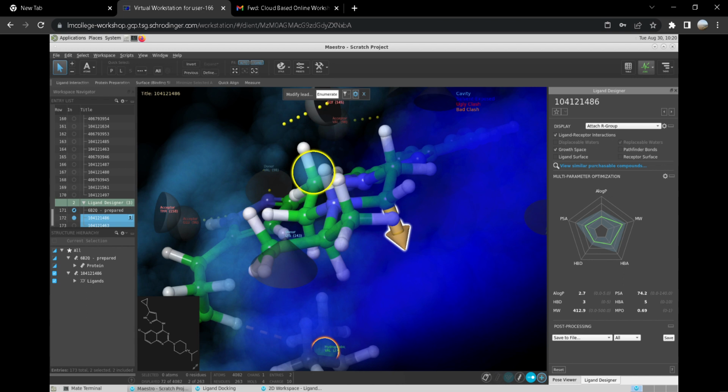And you can also see that sometimes it shows you that these atoms, like this group, is not going to be favorable because, let me just try changing. Yeah, you can see that it has orange colored spheres here, which means it has a bad clash with these atoms here. It's a bit close to those atoms. So things can be found out easily with these options here. And you can just see which substituents you are trying to check here, and if they can form interactions here.